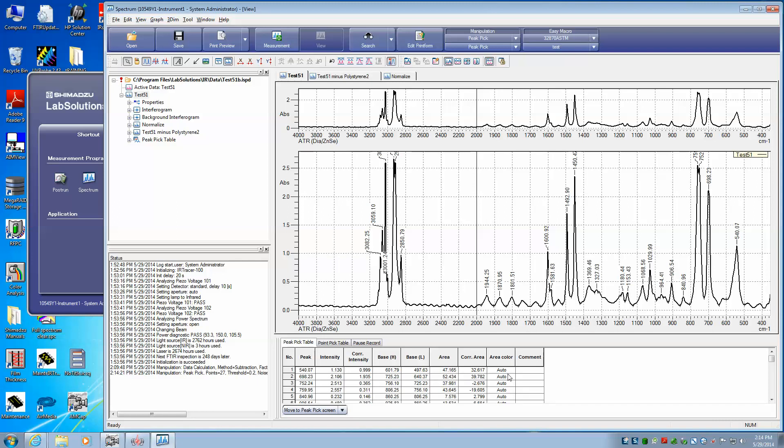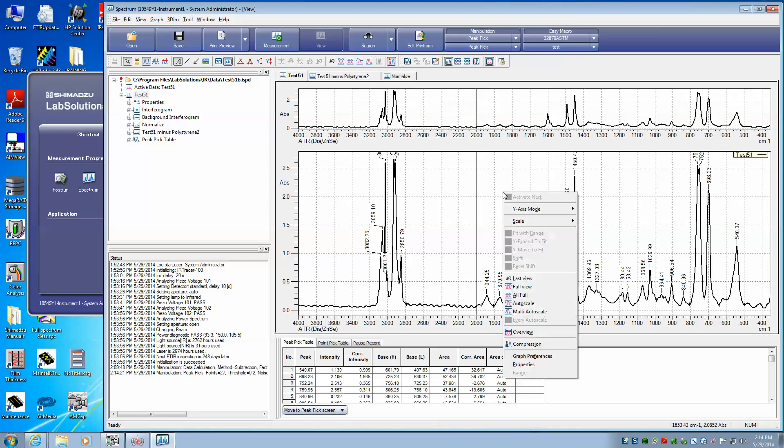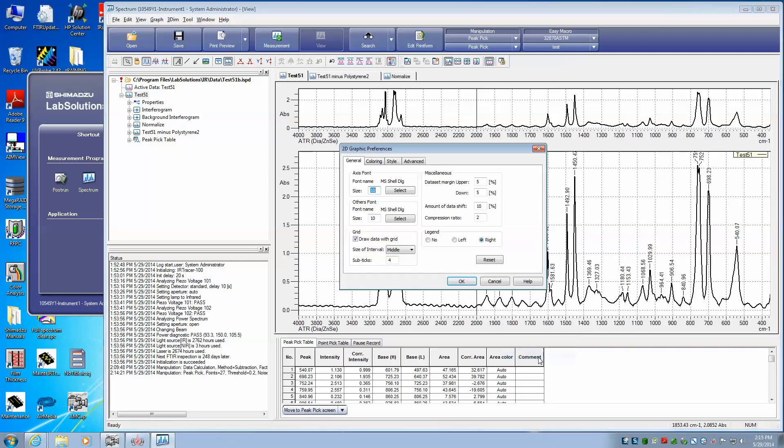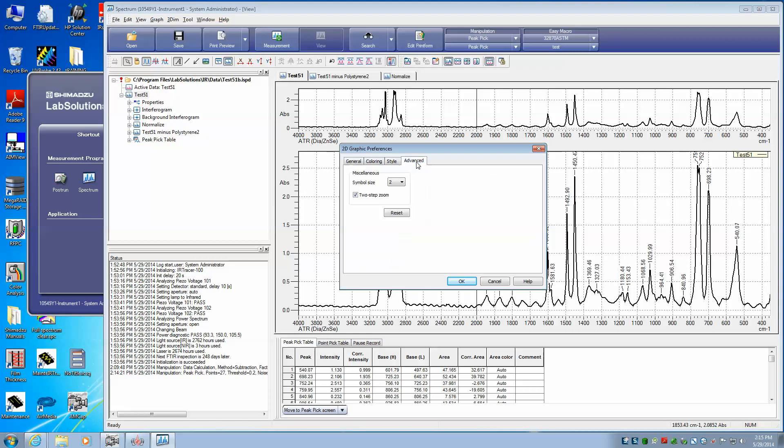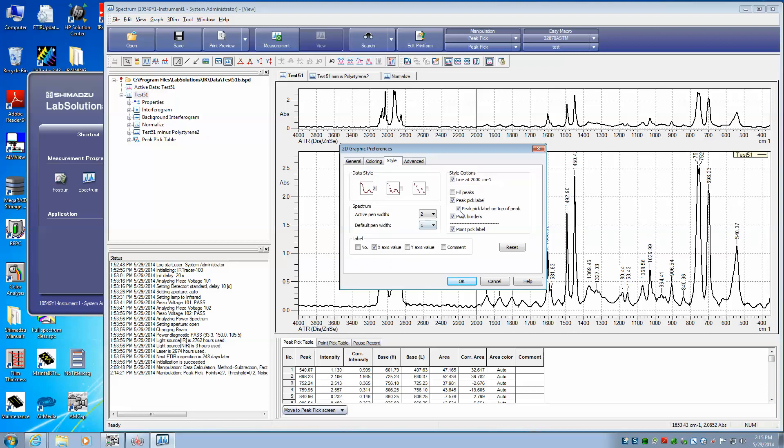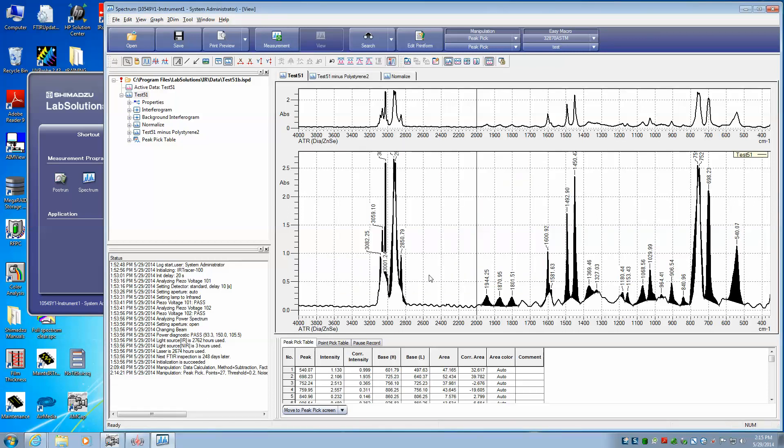and any color that we might add to it. It's possible by right-clicking and going to Graph Preferences and setting Style, we could actually fill the peaks. And if we select that, then our peaks are filled.